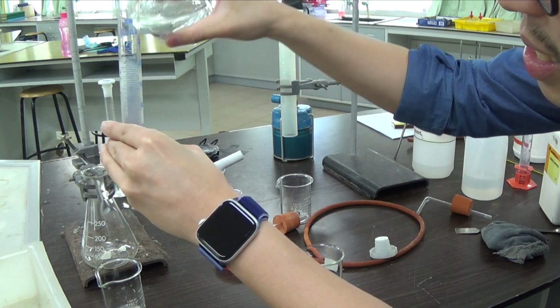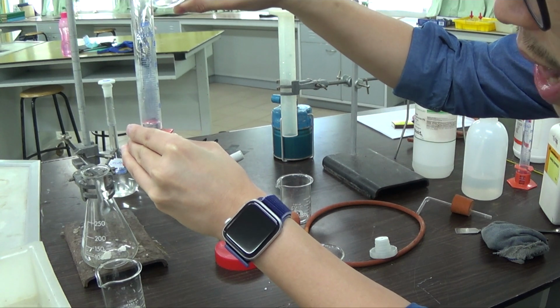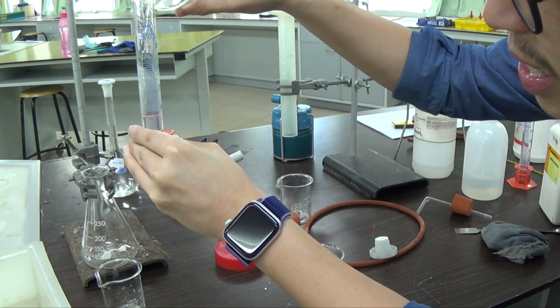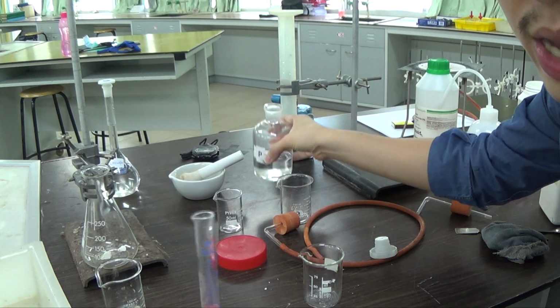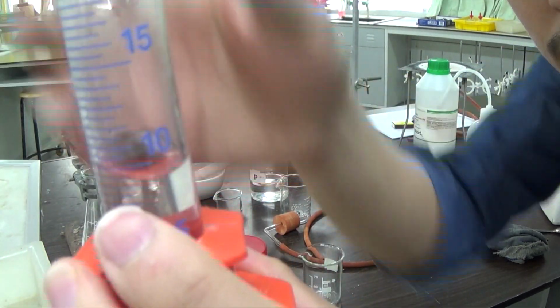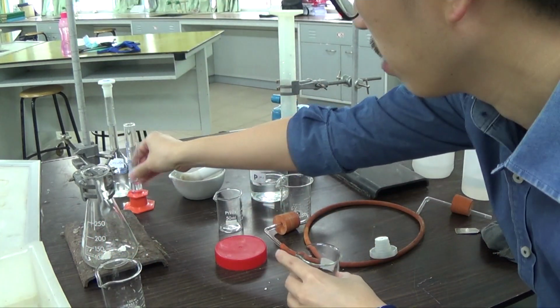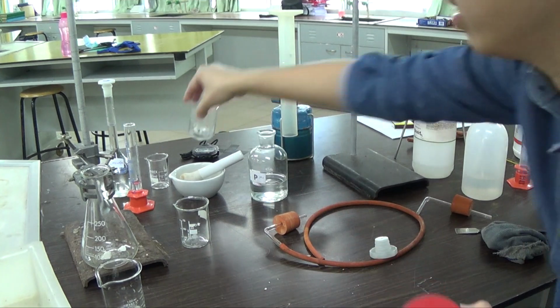When I use the acid, I must make sure that I use the same volume of acid as well, so that I'm not changing anything except the surface area. This one is a measuring cylinder. A measuring cylinder measures the volume of a solution, here around 10 cm cubed. 10 milliliters is 10 cm cubed.